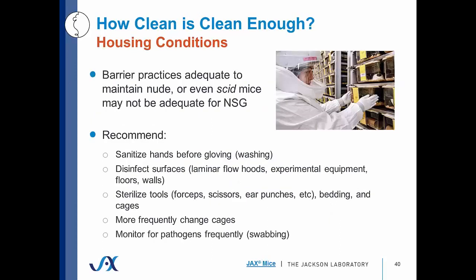Because NSG mice are so highly sensitive to pathogenic infection, it's really important to maintain barrier practices and techniques to reduce the level of contamination and the potential spread of infection. Barrier practices that are adequate to maintain nude or even SCID mice may not be adequate for NSG mice. That's why we highly recommend that you sanitize your hands by washing them before gloving.